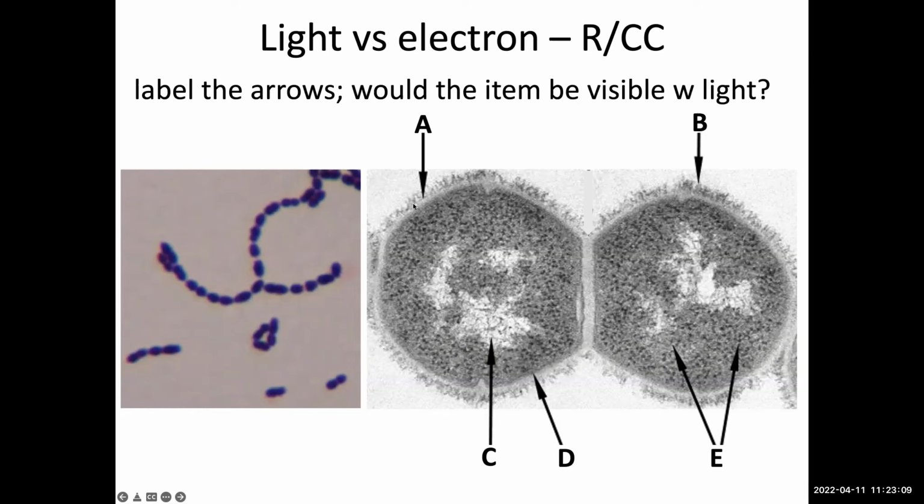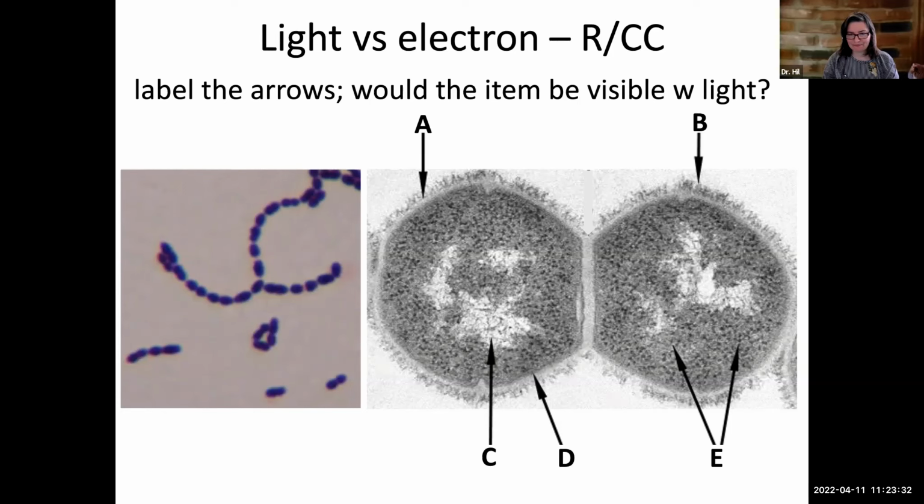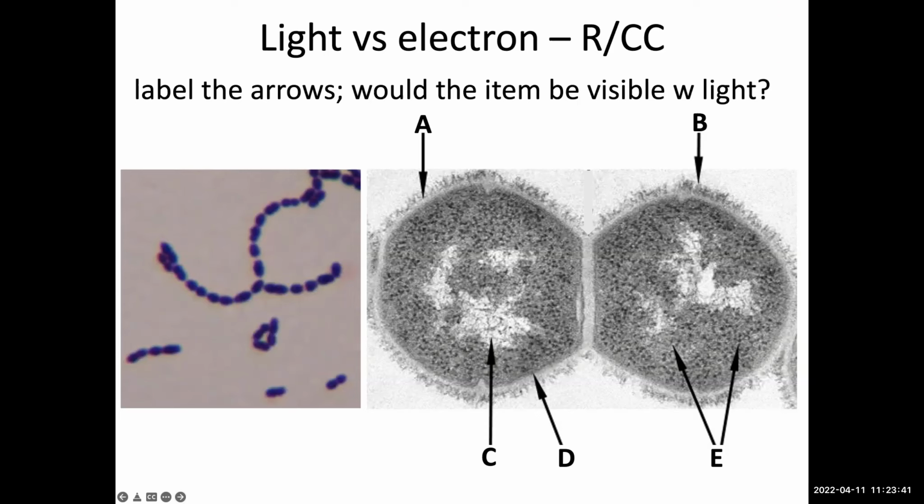I'm not sure, but I think it's cilia. Okay. Yeah. Let's go to Mai. What do you think B is? I was going to say B was cilia. Okay, great. Lanisa, what is C? I am going to pass. I don't know. Yeah, that's a great answer. I don't know is a great answer. Looking at this for the first time, that would be a really common answer. What the heck is that?